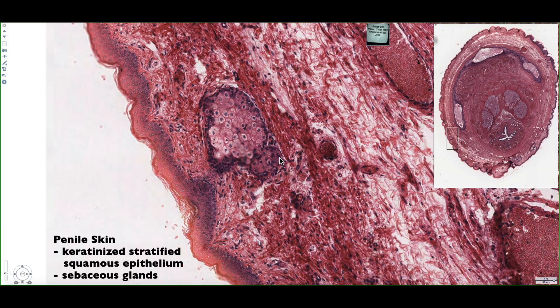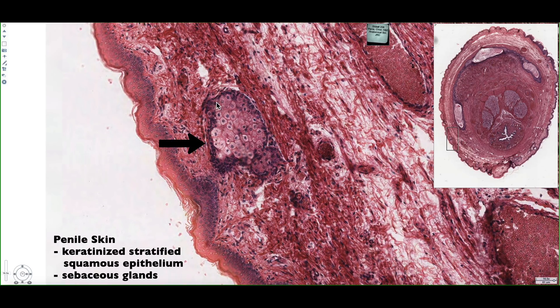Since the penis is surrounded by skin, we should expect a layer of stratified squamous epithelium, and that's exactly what we can see here lining the most external boundary of the penis. We can also see a layer of dead skin cells that is sloughing off — this is called keratin. So this epithelial lining is considered keratinized stratified squamous epithelium, and in some regions we can identify a sebaceous gland that is opening up onto the skin surface.